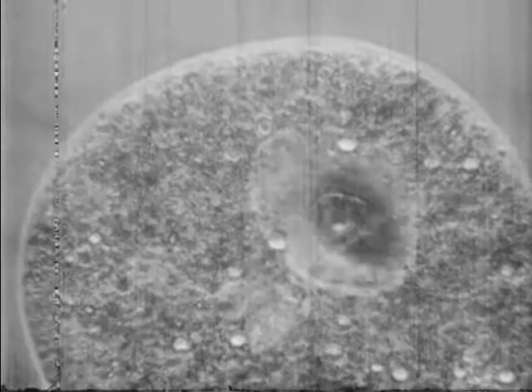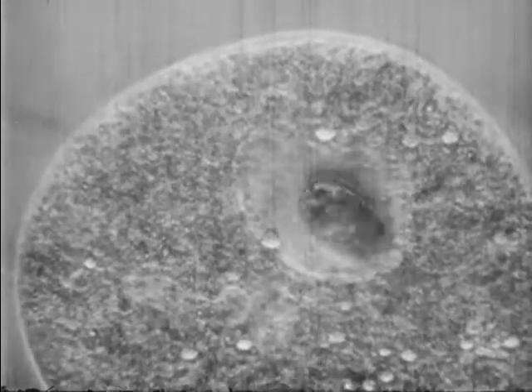Watch what happens to this smaller animal that swims in between 2 of the amoeba's false feet. The animal is trapped, and the amoeba slowly flows around to enclose it. The single-celled amoeba from our bottle moves, finds food, and digests it as we do ourselves.